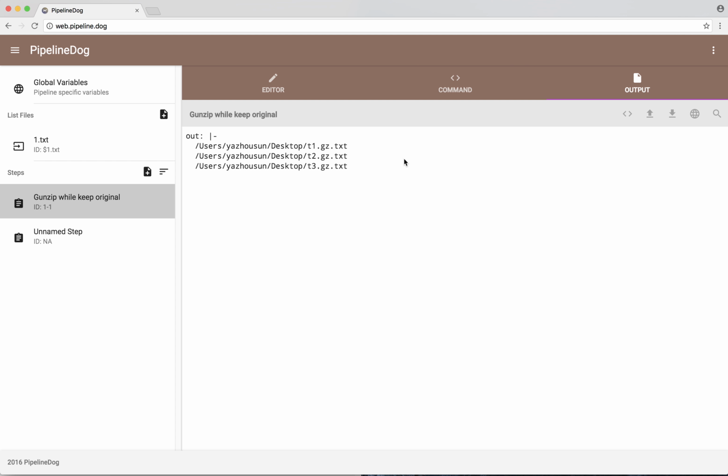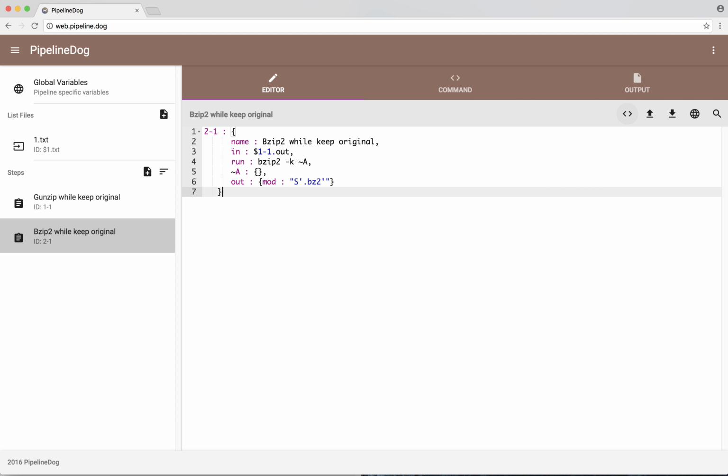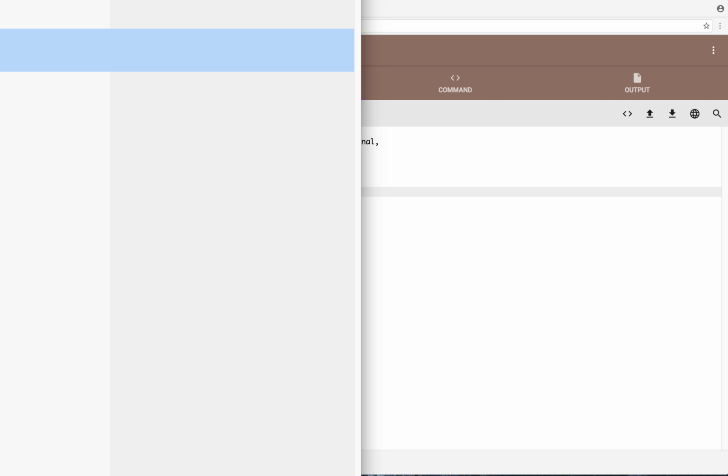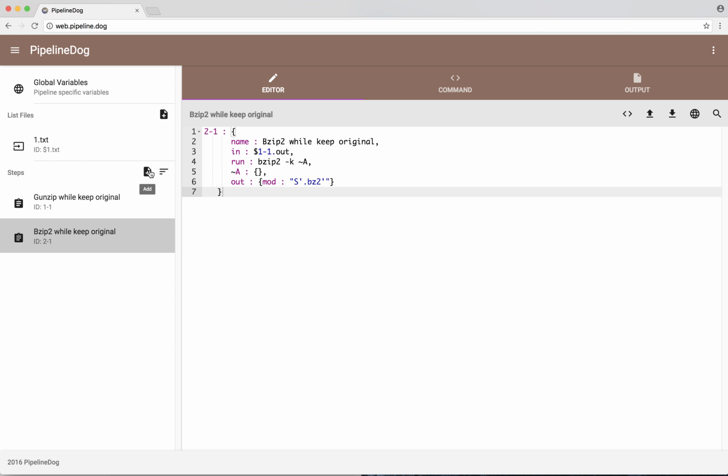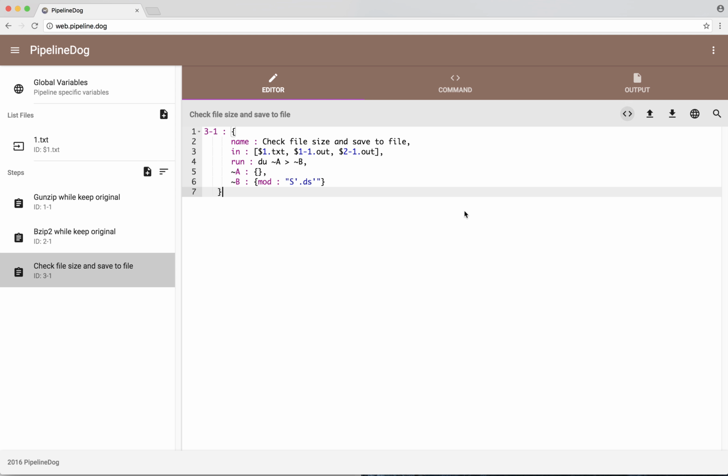Now we can create more steps. The second step I've also typed previously. Just copy paste it in, parse successful. Now let's create our third step. Click on this plus sign, click on this step, paste, parse. There we go. We have all 3 steps.